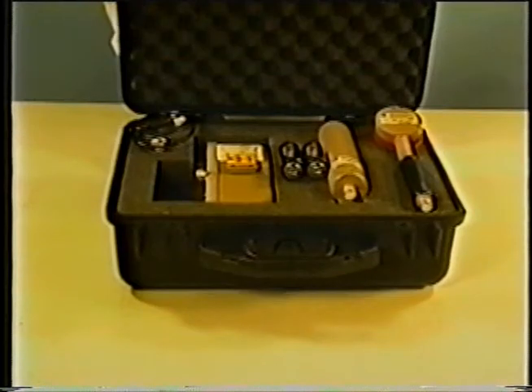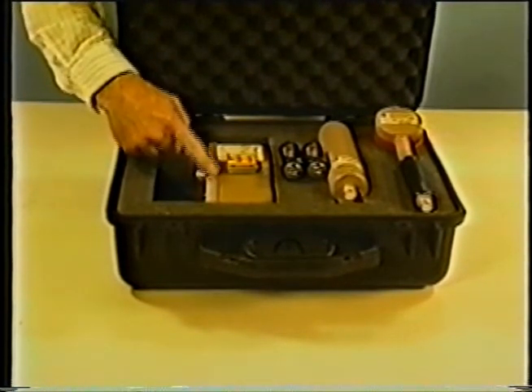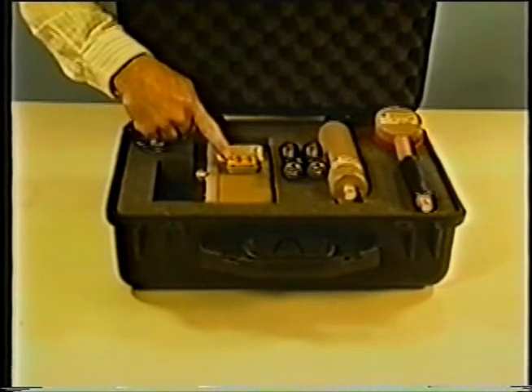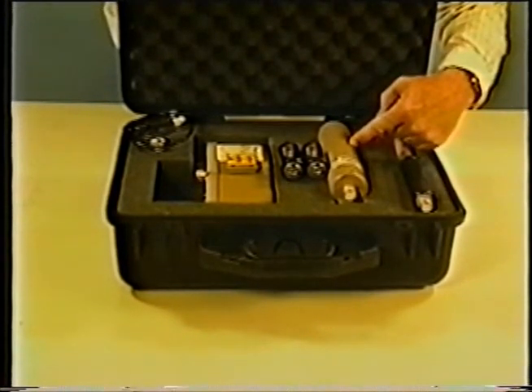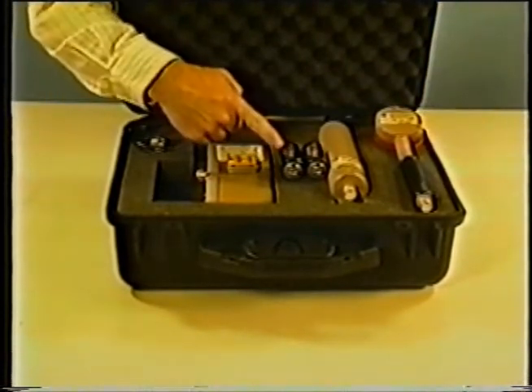This emergency response kit contains a Ludlam Measurements Model 2241-2 survey meter with the one microcurie cesium-137 check source mounted on the side, a Model 44-9 Geiger-Mueller alpha-beta-gamma detector, a Model 44-2 sodium iodide gamma scintillation detector, a detector cable, and batteries — all in a hard protective case.